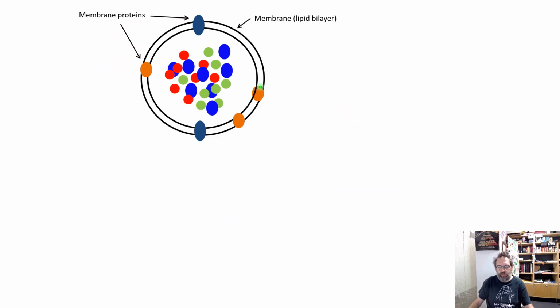So here's our particular cell, all right? And what we need to do is bust this thing open, okay? Because we can't get to the proteins unless we break these things open. So you can originally keep cells intact to try and isolate the cells away from things like culture supernatant, which, if you're working in cell lines, is a really important thing that you need to do.